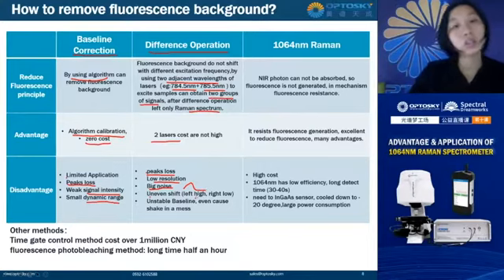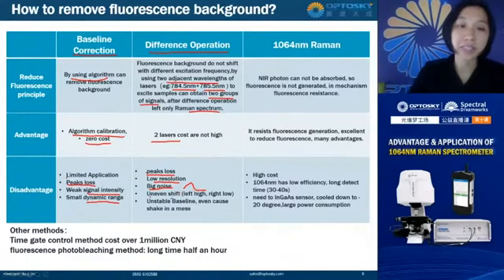So it will make the curve shapes distorted and not look so nice. The disadvantages are that it will cause uneven shift, the baseline becomes unstable, and it can even cause a mess.